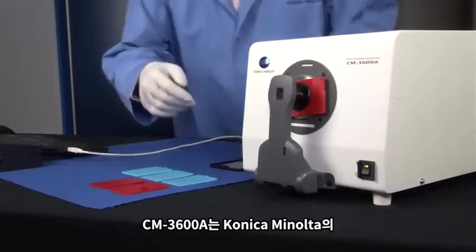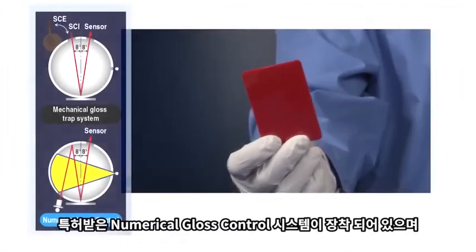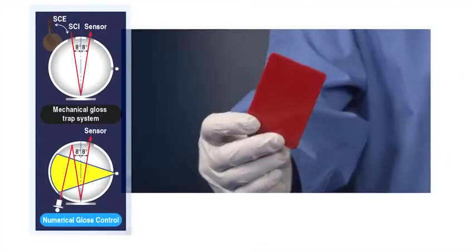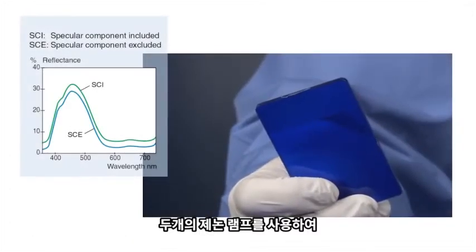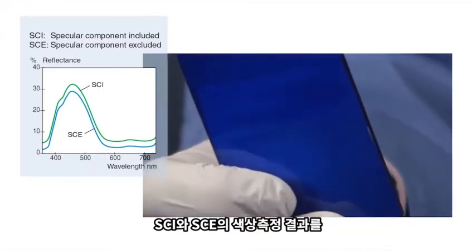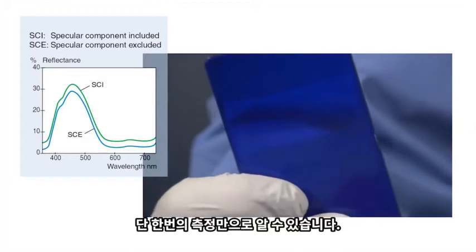The CM3600A features Konica Minolta's patented numerical gloss control system, eliminating the need for a mechanical gloss trap. By using two xenon lamps, the system can provide simultaneous color measurement results for specular components included (SCI) and specular components excluded (SCE) with just a single measurement.